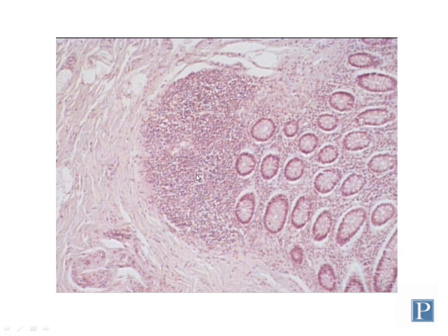Here's a higher magnification view. They look pretty dark at low magnification because they are densely packed with B lymphocytes. B lymphocytes have, if you recall, very large nuclei that fill most of the cytoplasm and stain very basophilic. So these structures look quite basophilic when viewed at low magnification.